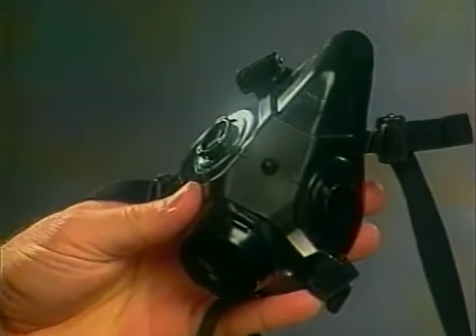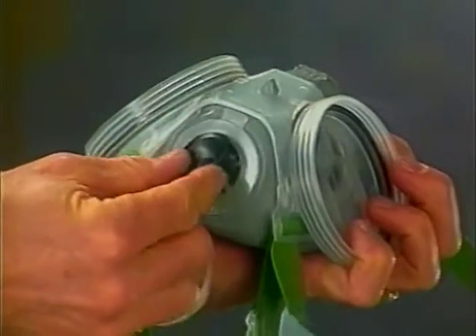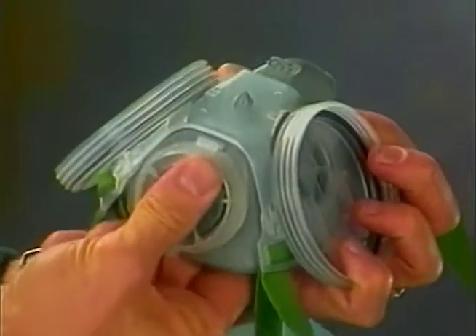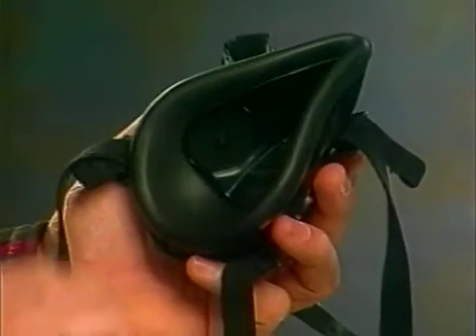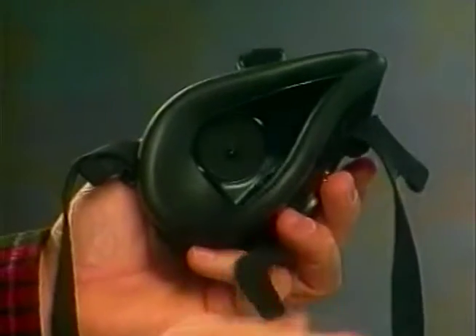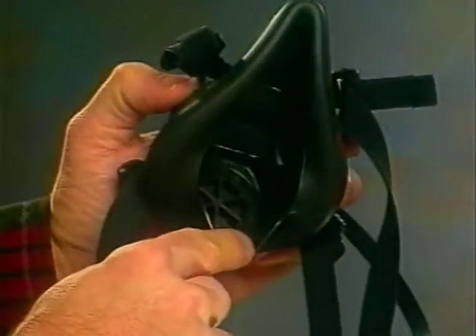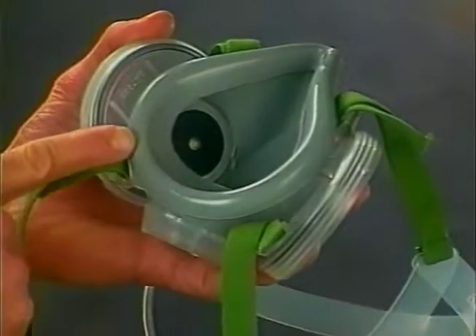A careful check of the respirator should be carried out before donning. First, check to see if the valves are in place and well seated. Check the body for cracks or signs of damage. Then, check the straps for damage or signs of overstretching. The respirator should not be worn if any of these items are damaged or missing. It should be either repaired or replaced.